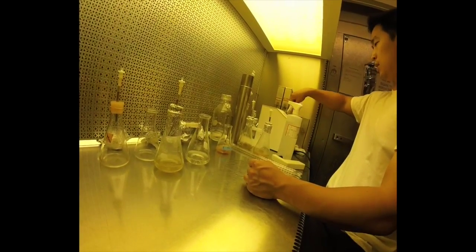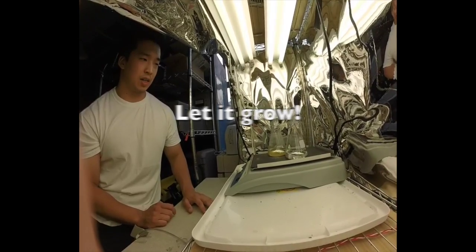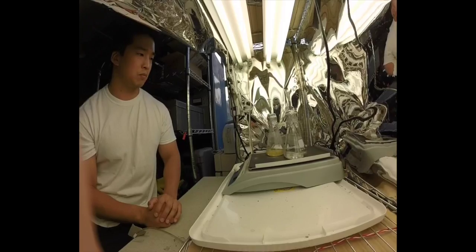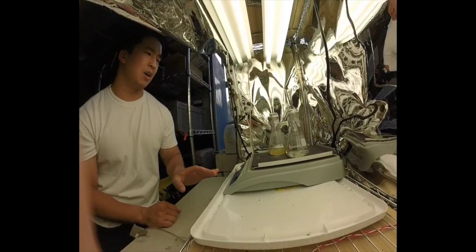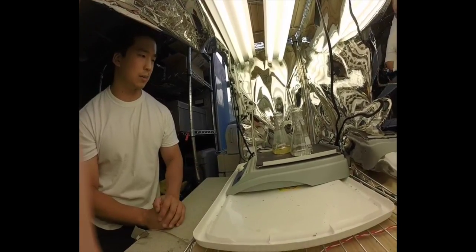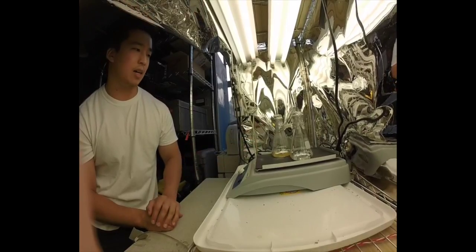So now we're in the glass tower, in the small enclosed growth space where we have continuous lighting. Just FYI, right now the light level here is around 80 to 90 microeinsteins per meter squared per second. And so this is where I keep the axenic Botryococcus.